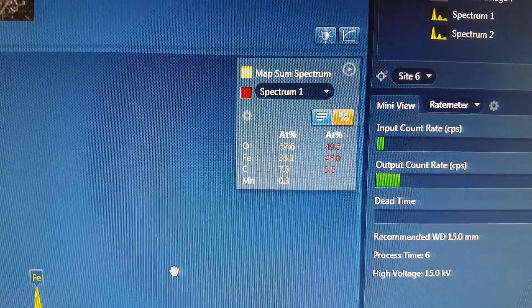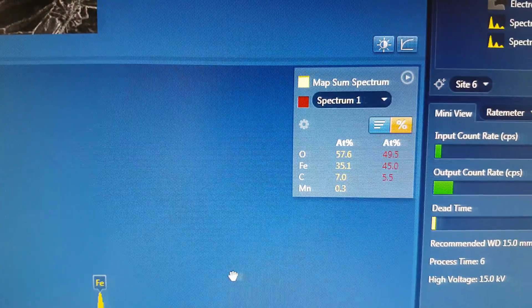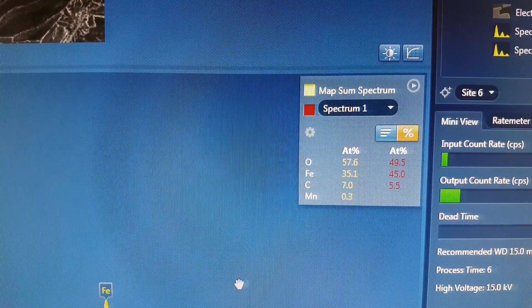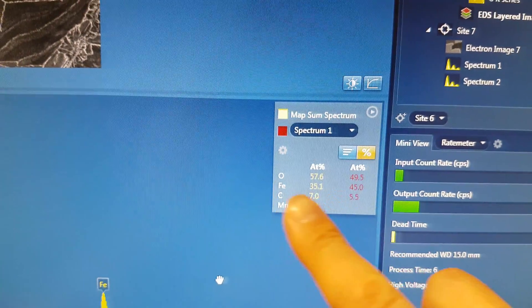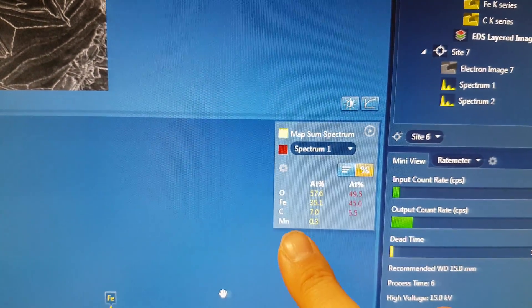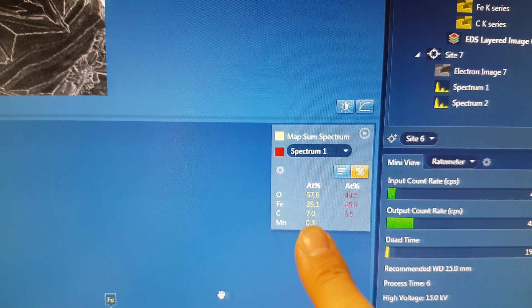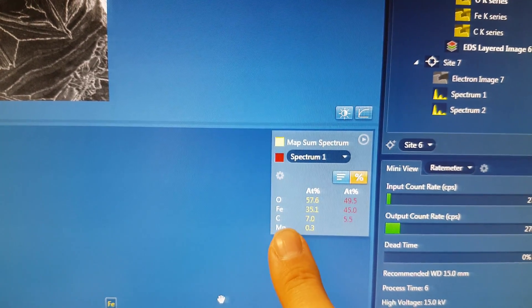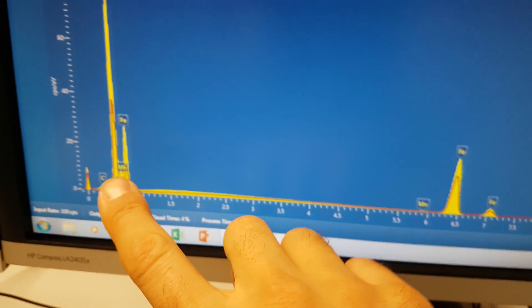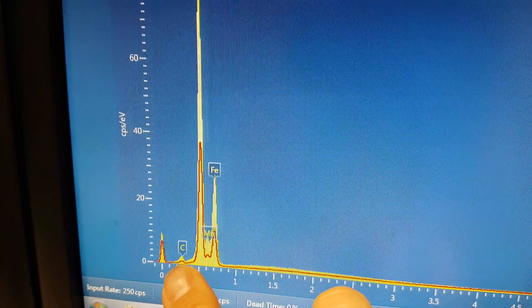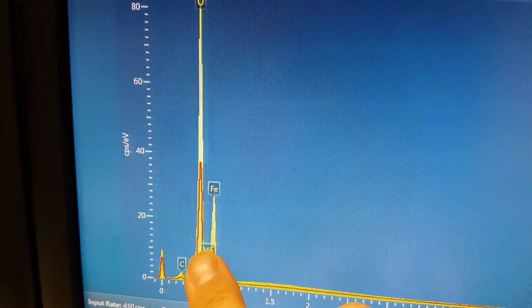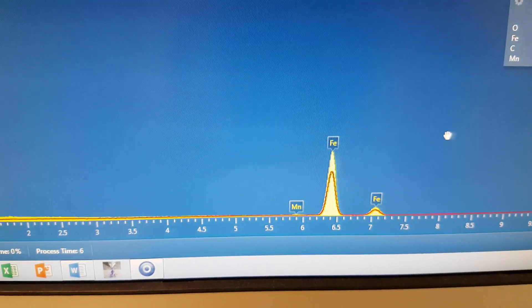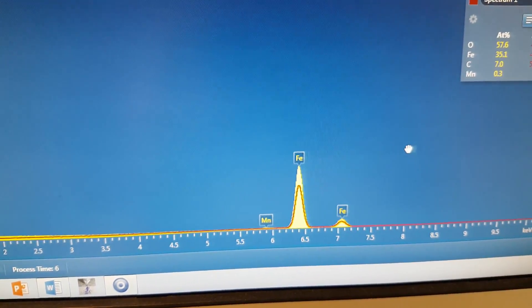Comparing the crystalline area with the fuzzy area, there's more carbon and there is some manganese, or certainly more. So you can see the carbon is up and the manganese is up compared to the fuzzy areas.